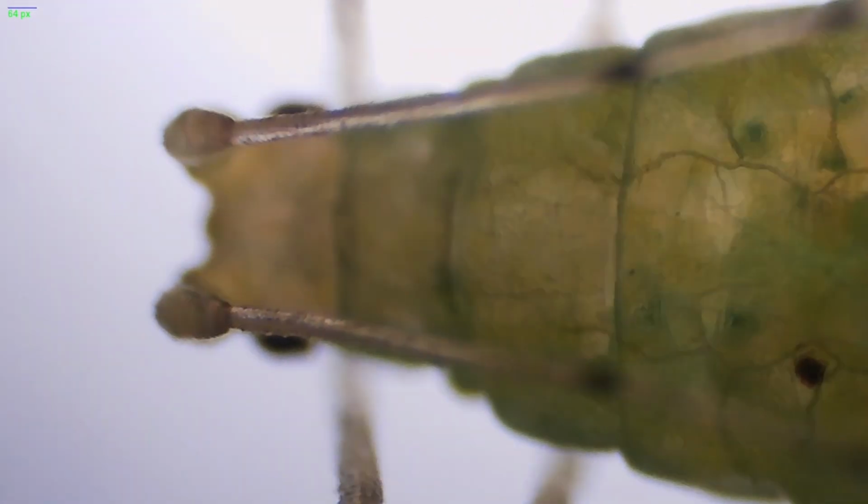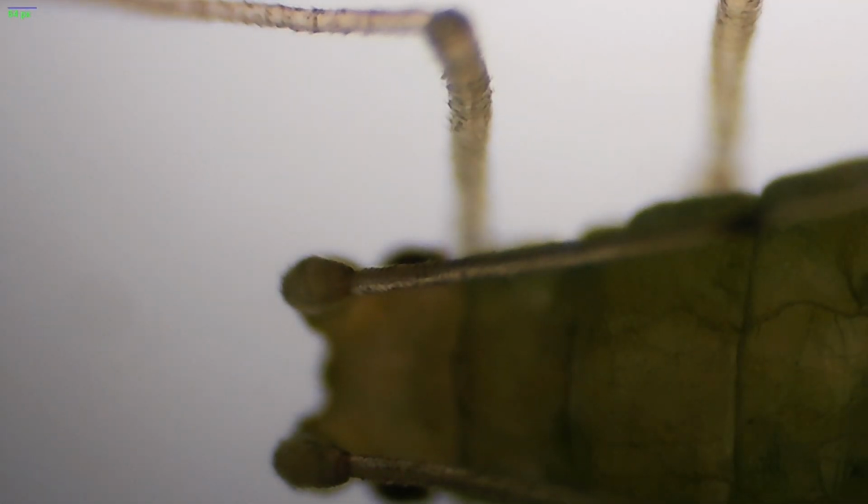And if you don't want ants, then you don't want these guys. Many people know that these things will produce a sticky substance that ants like, and ants will stick around these guys to eat that.